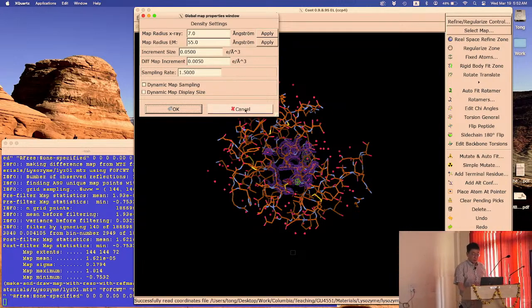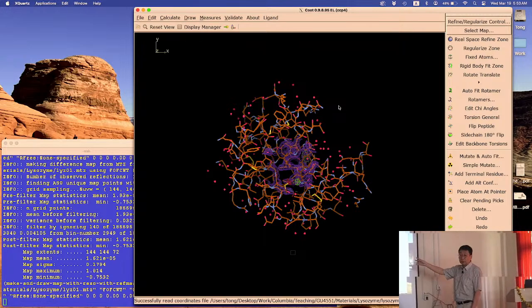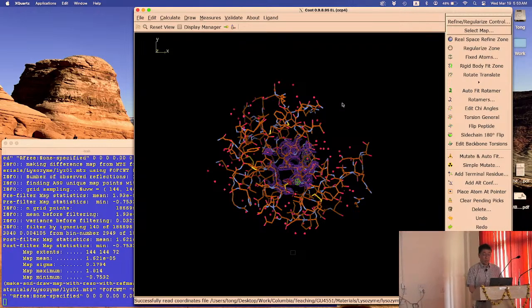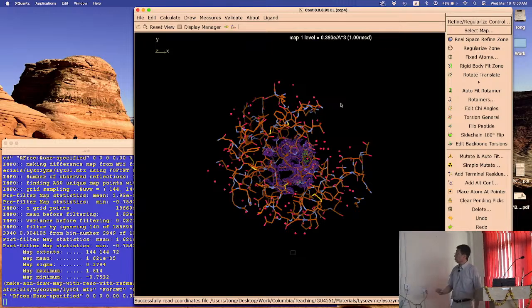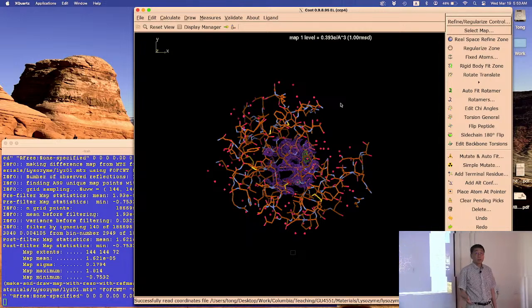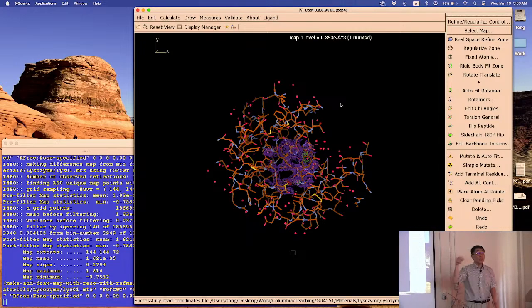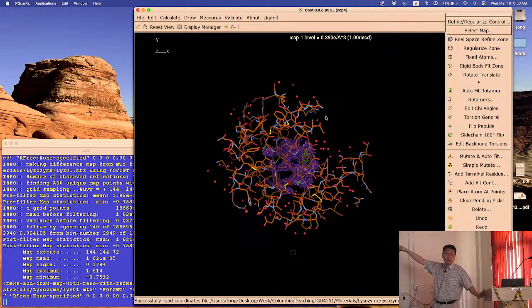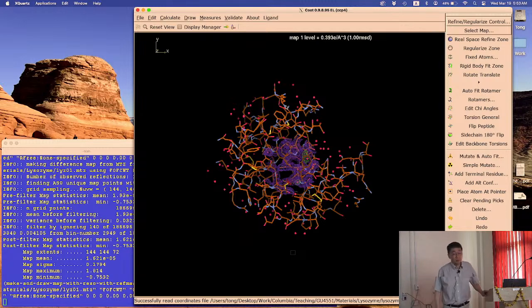So that's the first thing we do. Second thing we do is change the contour level. And remember, middle wheel, spin the wheel until it's 1. So a number should show up at the top. It says 1.00 or somewhere around there. That's the middle wheel on your mouse. Spin the wheel, and then this will show up. Got it? No? Uh-oh.